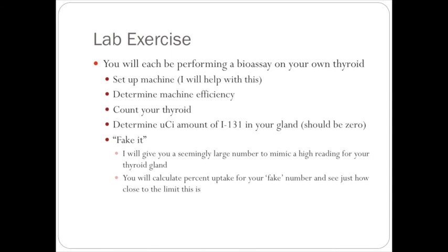All right, so to close, for lab next week you are each going to be doing a bioassay on your own thyroid. As I mentioned, we will set up the machine, which basically means we're going to check the calibration and make sure it's calibrated for I-131. I will start this process and get it kind of close, and then we will go through and double check it. So what you will be doing is fine-tuning the setup to make sure that it truly is calibrated for I-131.